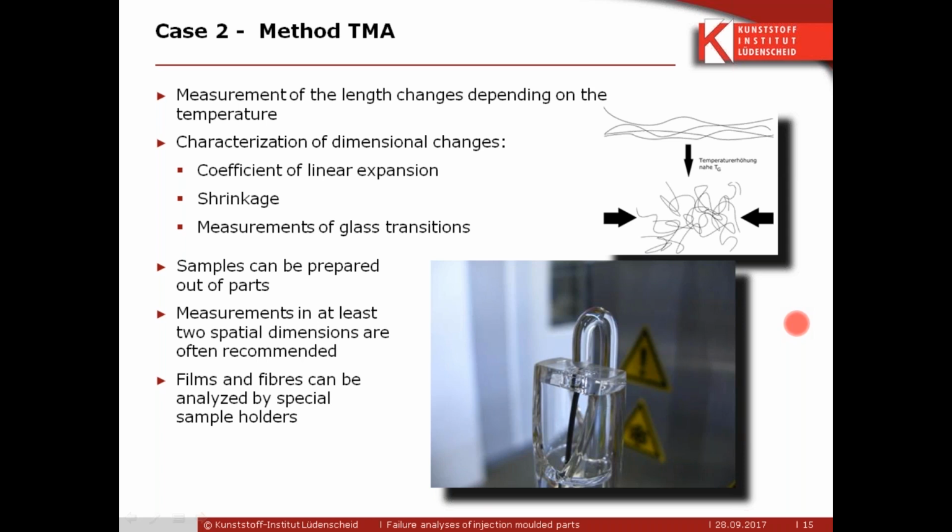We only got the information and we didn't measure the density. But you're right, I think the density will be different, and that might also be part of the problem. But density differences appear due to the different polymer production. Exactly. The root cause is the molecular weight of both.